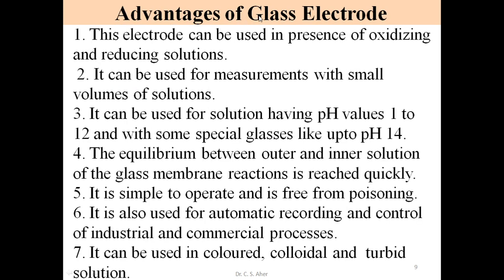What are the advantages of this glass electrode? First, this electrode can be used in the presence of oxidizing and reducing solutions. So we can determine the pH of oxidizing and reducing solutions.